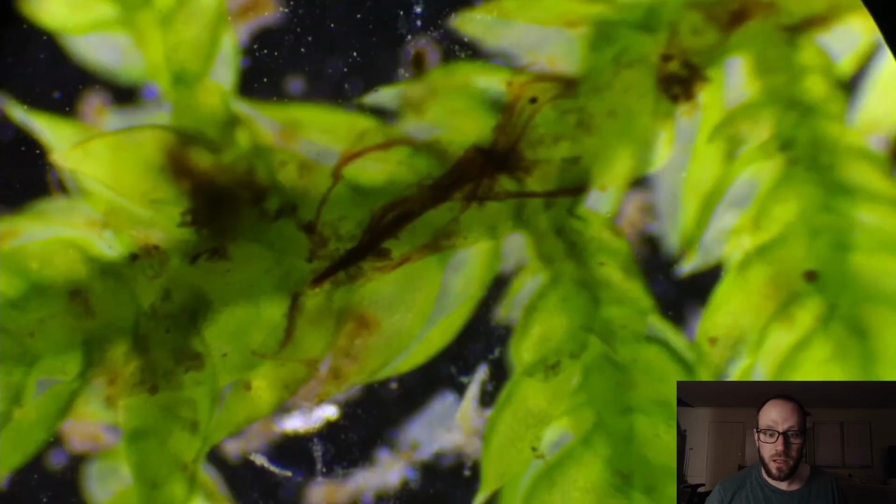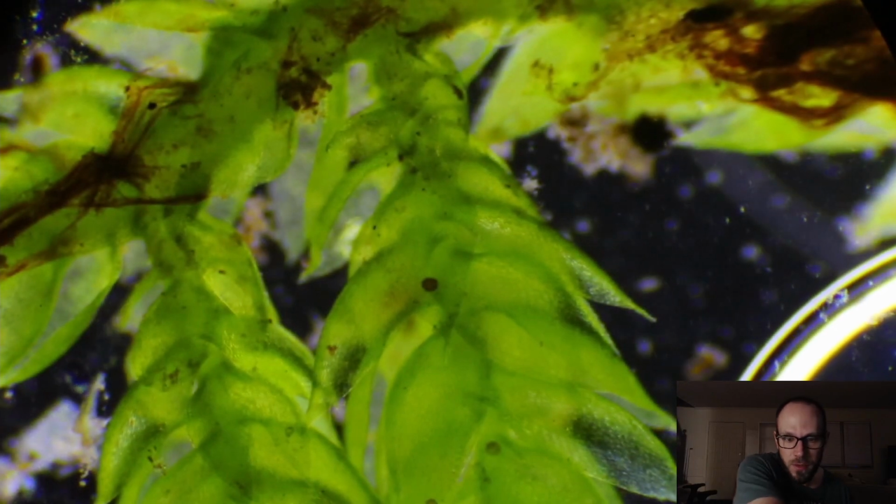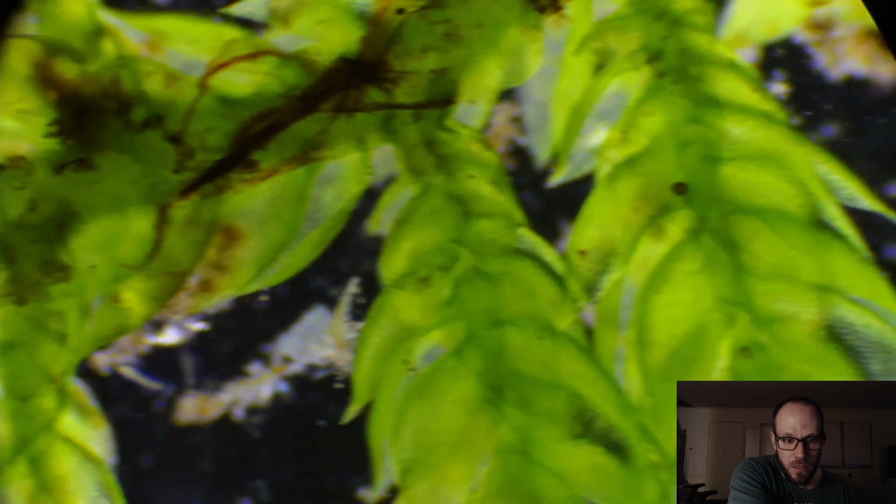Still though, you see there's a lot of cool stuff on here. A lot of cool stuff. I've been waiting to accidentally, because I'm not going to do it on purpose, but accidentally injure myself so that I may see my own lifeblood.